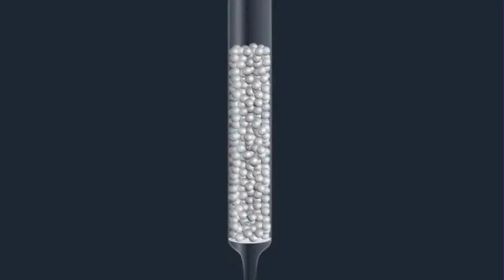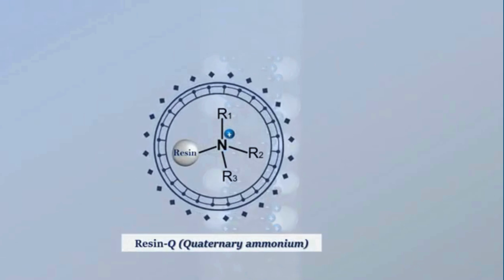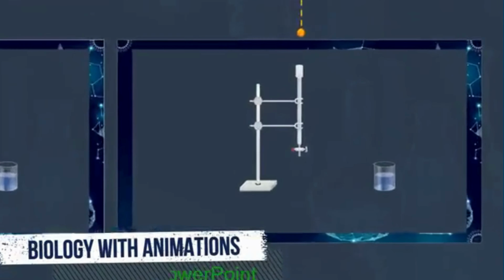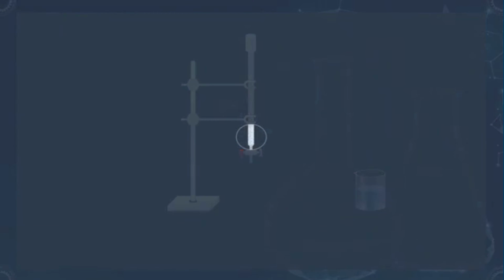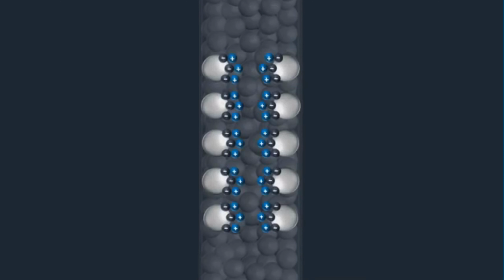For an anion exchanger, different analytes have different affinities for the stationary phase. Consequently, they migrate through the column at different rates and elute as separate peaks. For biomolecules, retention depends strongly on the net charge and charge distribution of the molecule at the selected pH. Proteins are particularly useful examples.